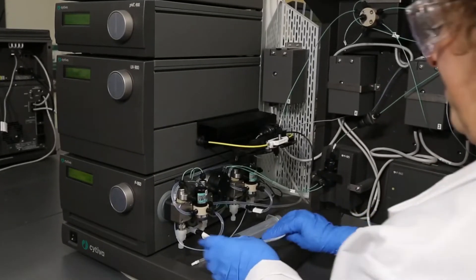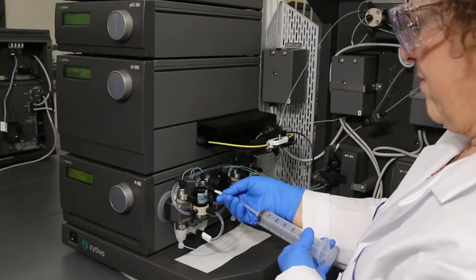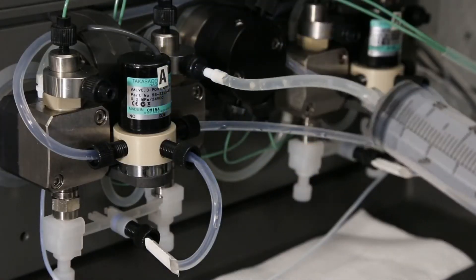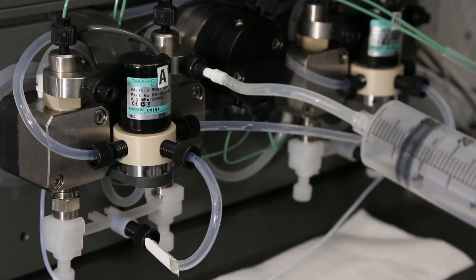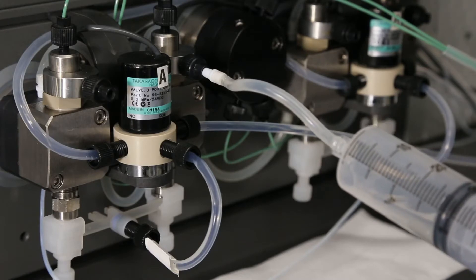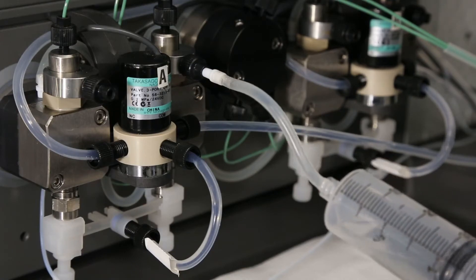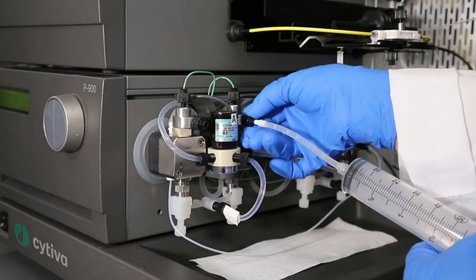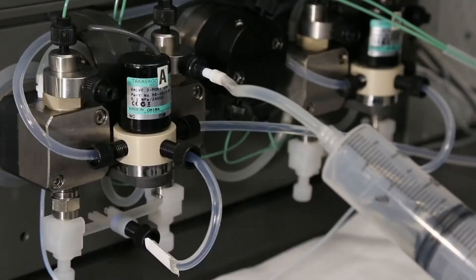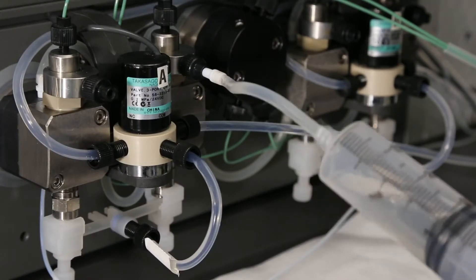Attach a syringe and purge tubing to the purge valve on one of the pump heads for the pump you are priming. Open the purge valve approximately one full turn and gently draw back on the syringe. Avoid drawing on the syringe too forcefully, as this may create additional air bubbles through outgassing within the pump heads. If you are unable to pull any buffer through, continue opening the purge valve until buffer begins to flow into the syringe. Continue drawing buffer into the syringe until you have removed all air bubbles.